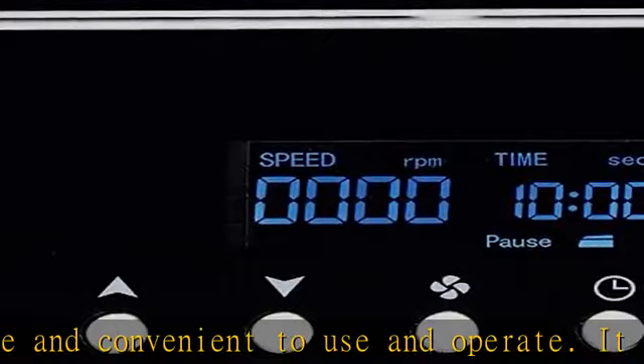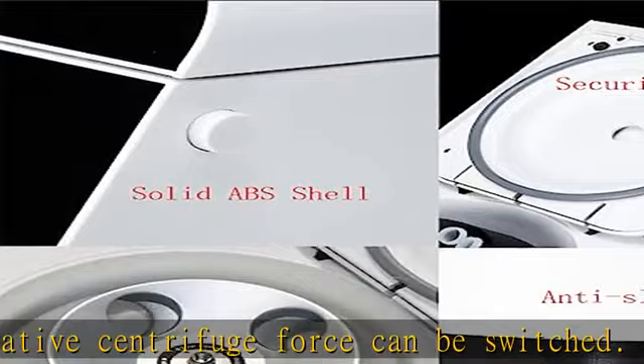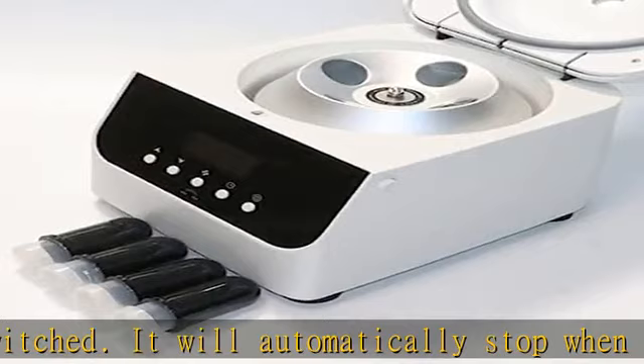Widely used in fields such as serum separation, fat purification, pharmaceutical development, and more. This lab centrifugal machine has a nice appearance, large capacity, and high efficiency, and is in line with international safety regulations. Check the description to get this product today at the best price.